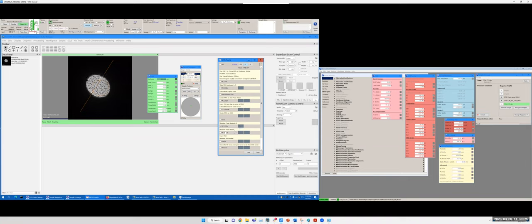So I can better tune it by using a smaller defocus, because the movement is exaggerated at a smaller defocus. Okay, now I think this is nearly perfect. I just want to finally tune this Y. Okay, perfect. Now I think I'm done with tuning the shape of this MOA.